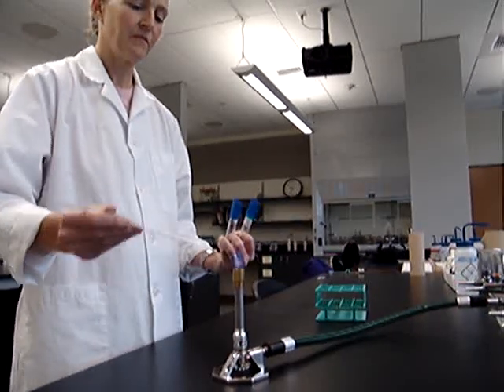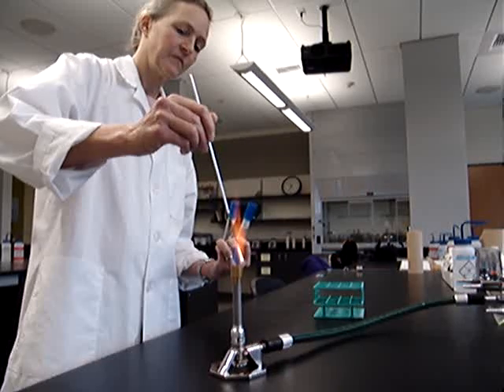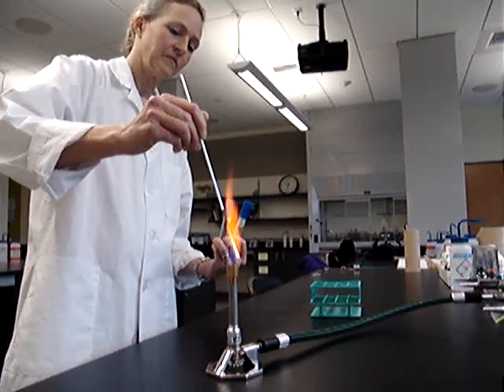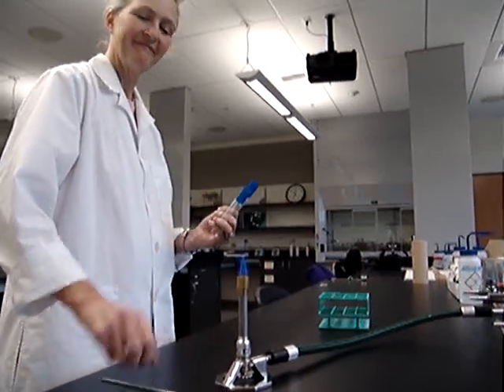Again sterilizing the loop. Great — and she has just performed an aseptic technique transfer.